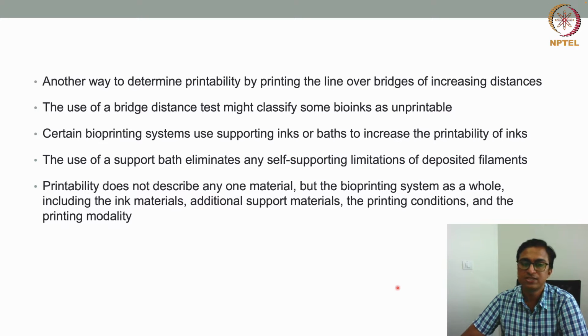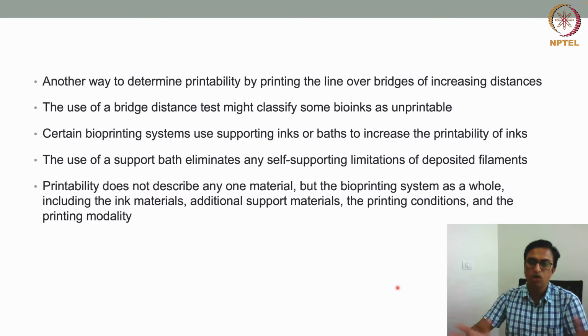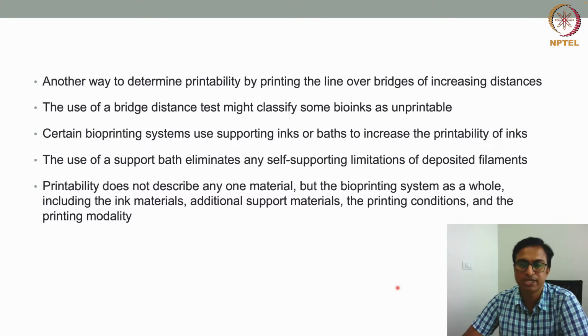So we can now define that printability doesn't describe any one material. That means we cannot classify the bioink as not printable based on certain tests alone, because it also depends on the whole system, including the ink materials, additional support material, the printing conditions, and the printing modality.